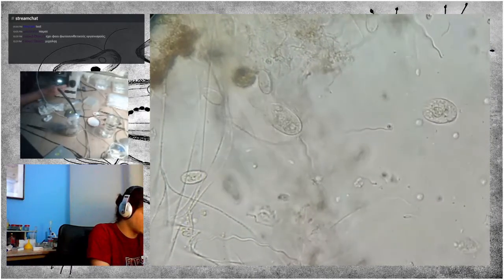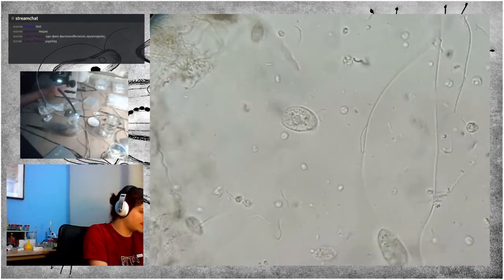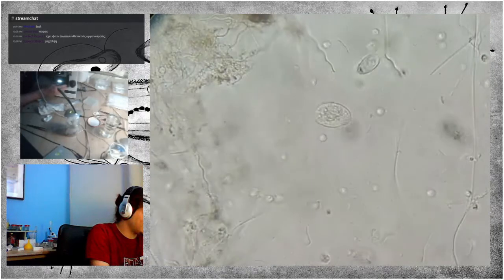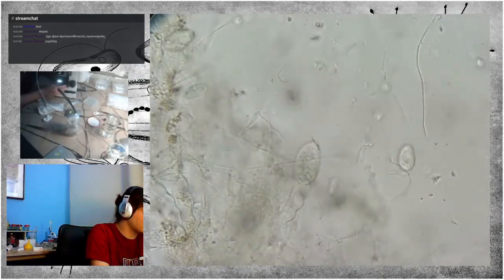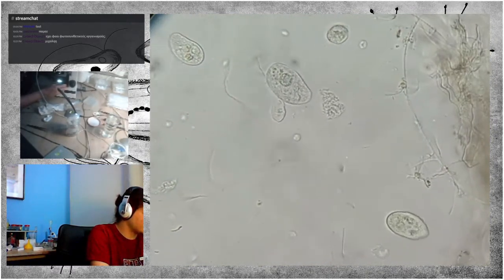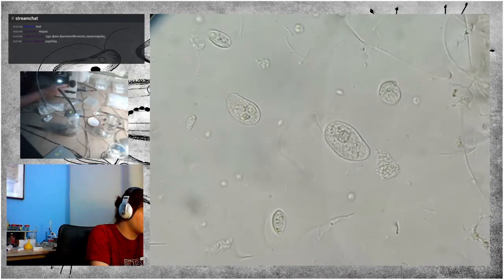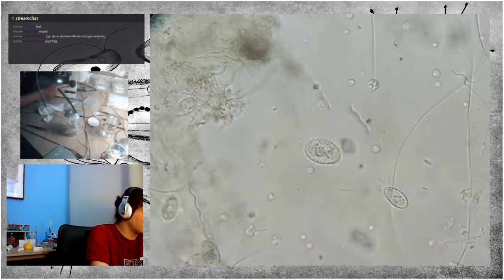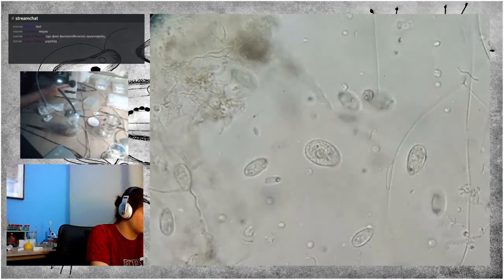I do not recognize them, neither them nor the small ones. But I think it is a species, or at least the large ones I'm talking about, something that I haven't seen. And this one is the same species as this one, I think. You can see the large structure in the middle, the spherical one.